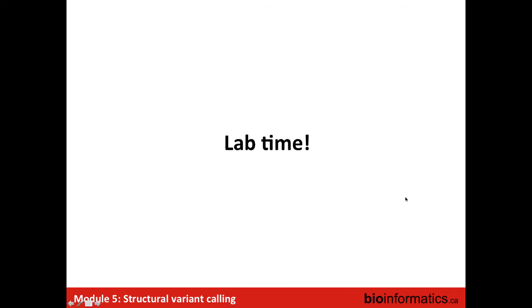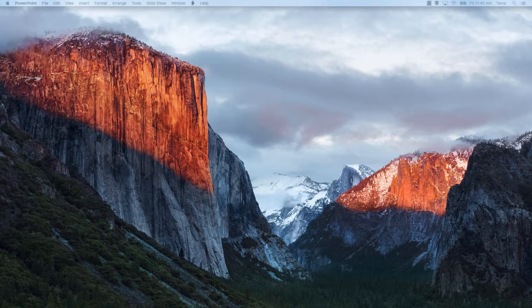Do you have any questions? Does this tool work with targeted data? Most of them could work with targeted data, except the read depth tools. But not PopSV. PopSV would work, because the problem with targeted data and read depth is that your coverage in targeted data, in exome sequencing for example, is linked to how many probes you have.